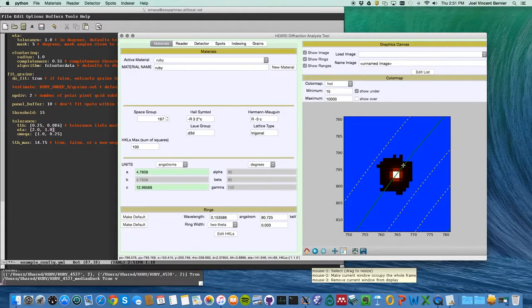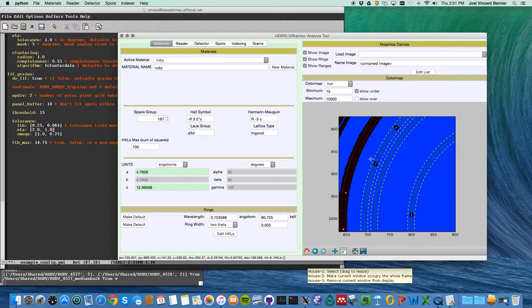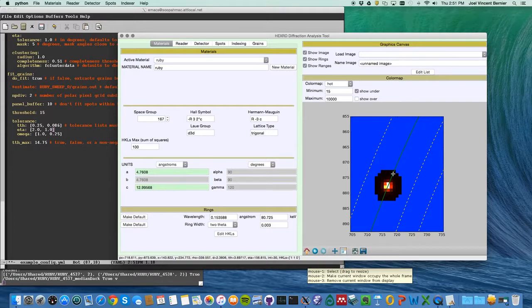So this is all background around where the actual spot is. But 140.4, 142.8. Yeah, okay, so that's 2 degrees if I want to do all the background. If I'm somewhere inside the background here, 156.8 to 158.3. So basically the width of that spot is something close to 2 degrees. The 1 degree spot would be if I'm much closer to the signal here, 157 to 158, 1 degree is probably, I don't want to go much smaller than that to capture enough of the signal.